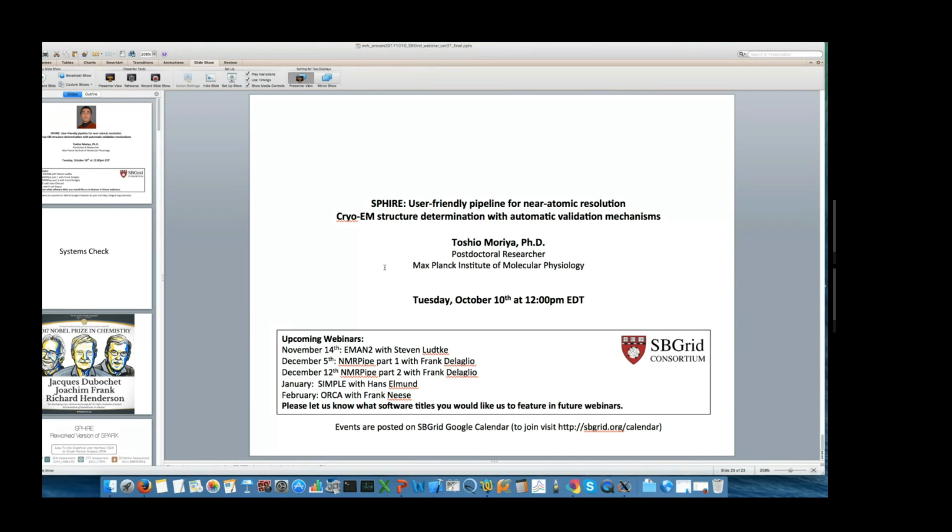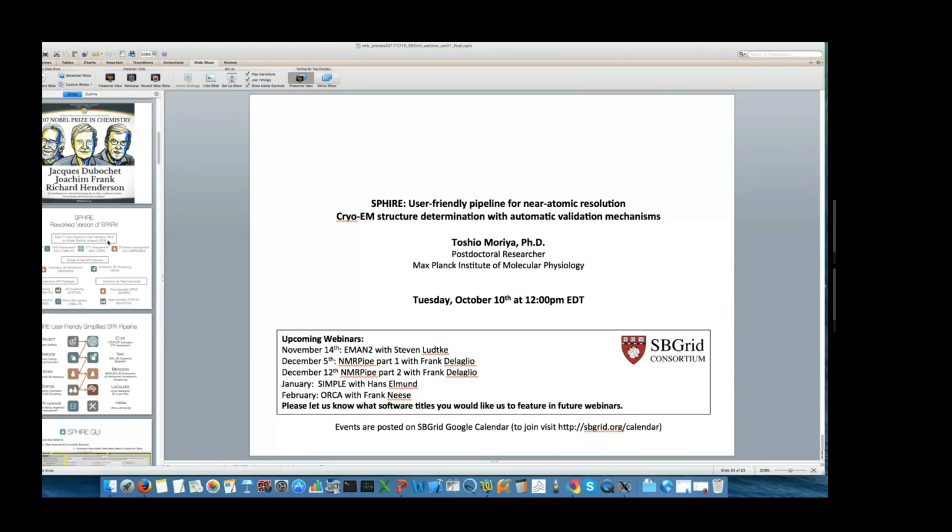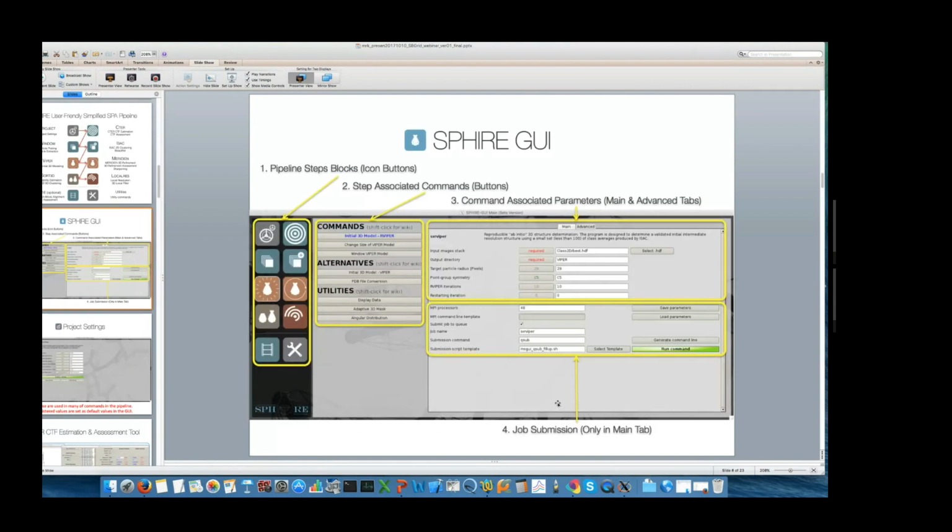But I recently got a mail from a user suggesting that we may want to have more variables that we can use for creating the job submission script. Can you see the screenshot still? Yes.